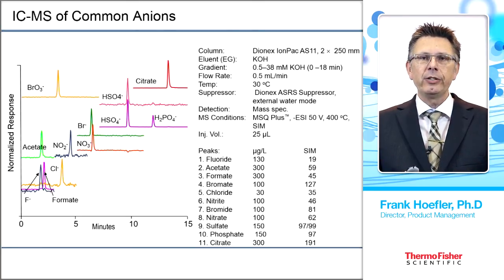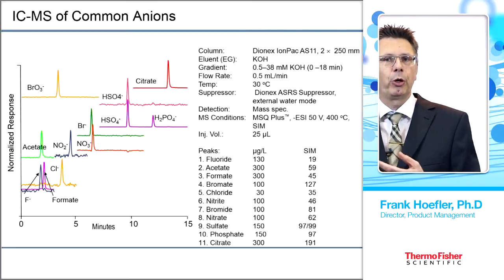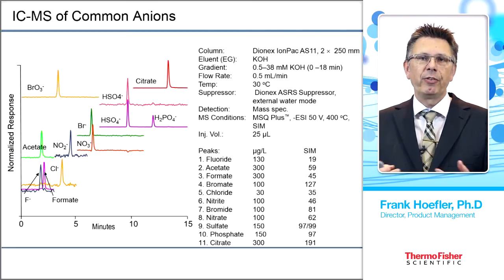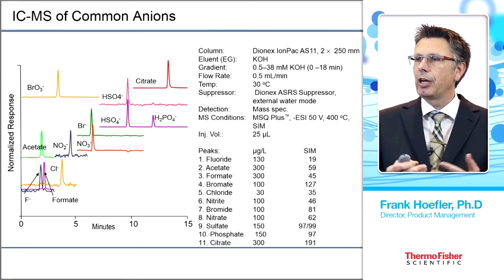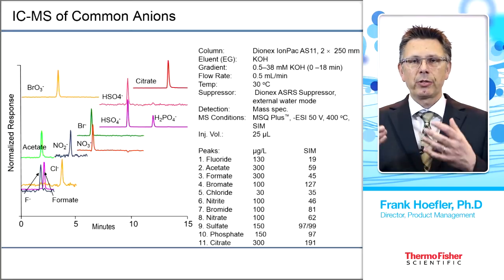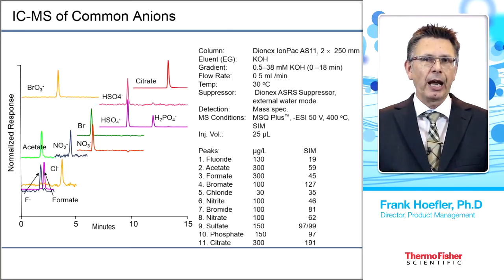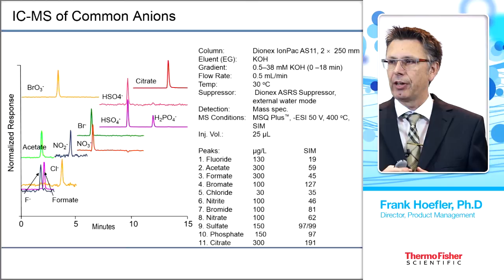This makes it really easy to increase the certainty about which analyte is eluting from our IC column, and specifically if we have large concentration differences, and I will show you examples later on, it makes it a very viable technique. We see further ions here eluting like nitrite, nitrate, bromide, and sulfate, which is detected here as a singly charged ion because after the suppressor we have a neutral pH value, at mass to charge ratio of 97.